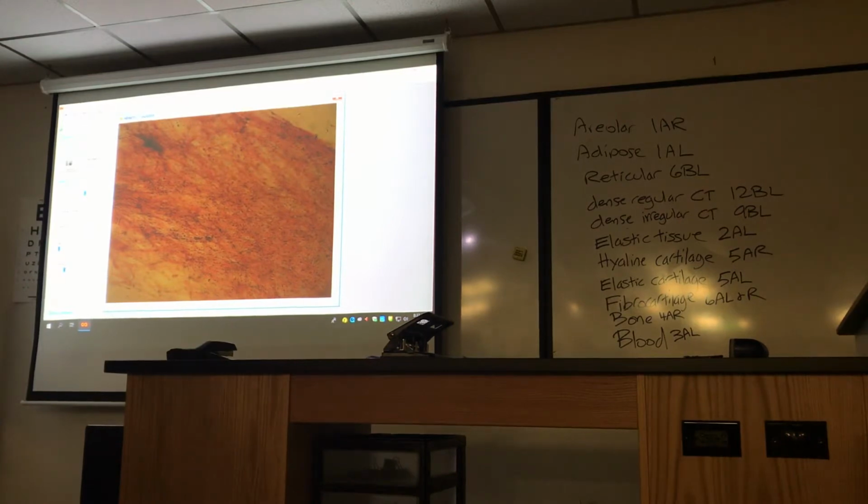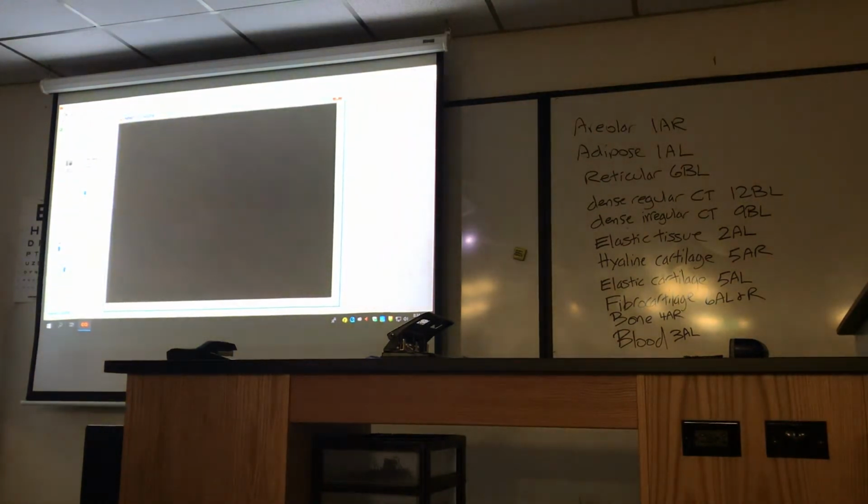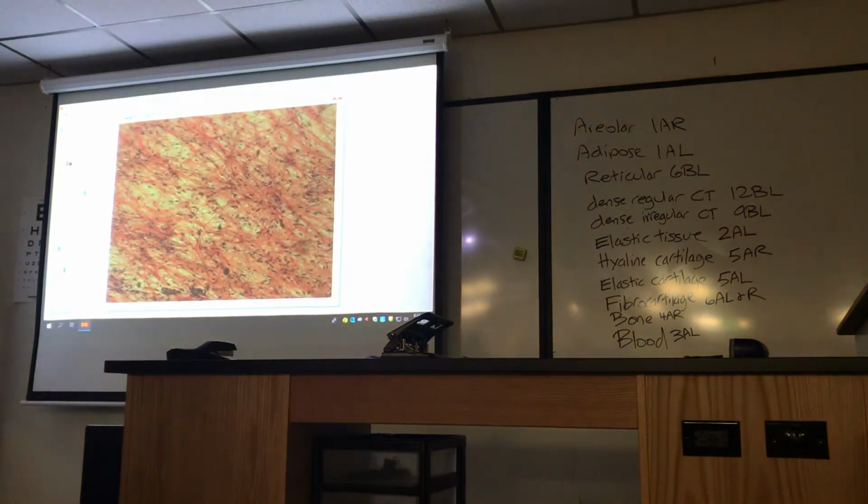Nice. There's a low mag. Let's go 100x. Things are coming in more clearly now. Well, that's fast. All right, 400.